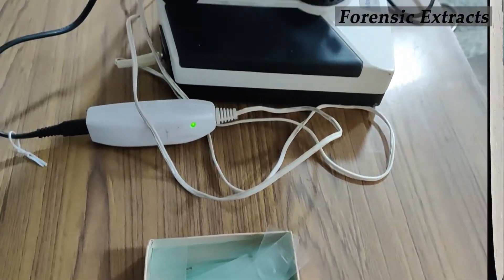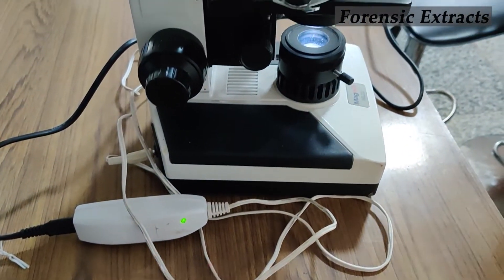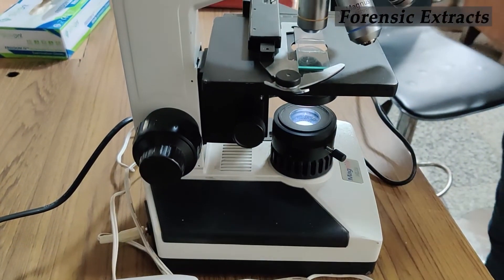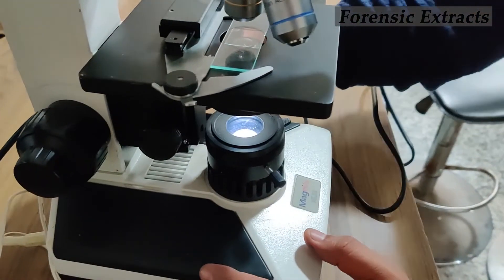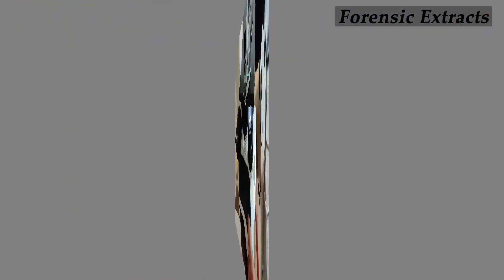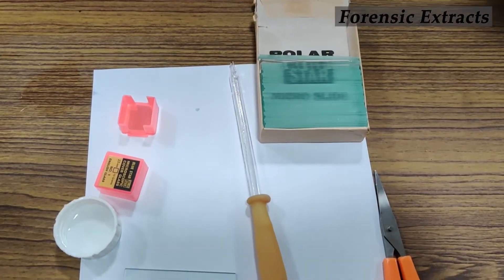Hair examination is very important. Making a slide and observing it under a microscope is necessary.